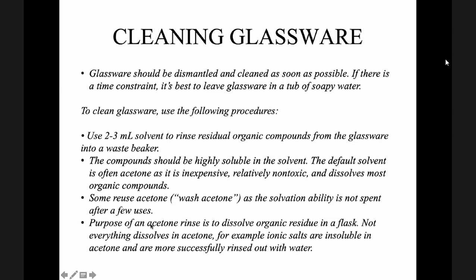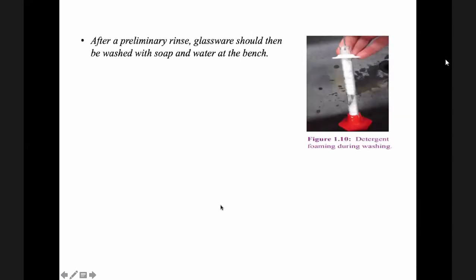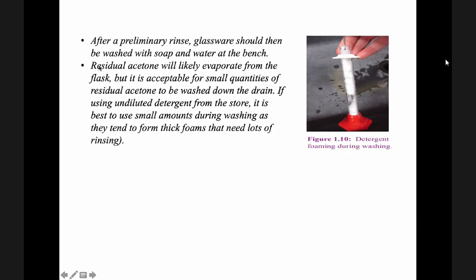But take note that not everything dissolves in acetone, for example ionic salts. For those you must just use water. Then after that, glassware should be washed with soap and water at the bench. Residual acetone will evaporate from the flask, but it is acceptable for small quantities of residual acetone to be washed down the drain. So this is waste management, through dilution.